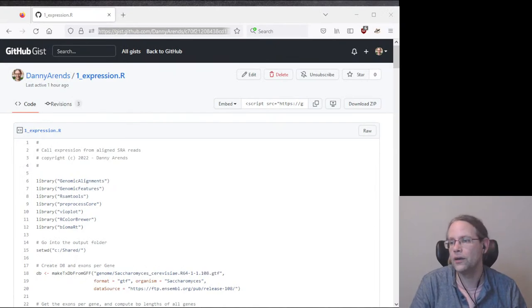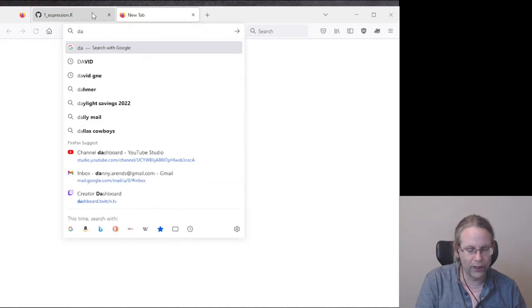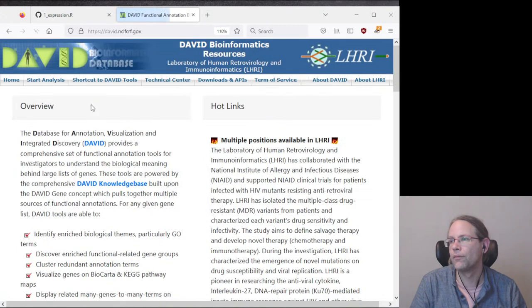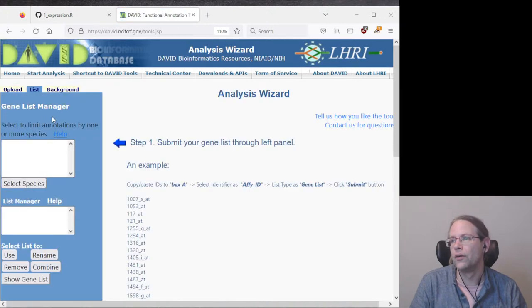So you go to here, which is my GitHub page. And then we go to David. So I'm just going to Google it. I'm just going to say David Gene. I'm going to go here. Right, so David is the database for annotation, visualization, and integrated discovery, which is a quite nice name for it. But I'm just going to click start analysis, right? And then I have to do a gene list.